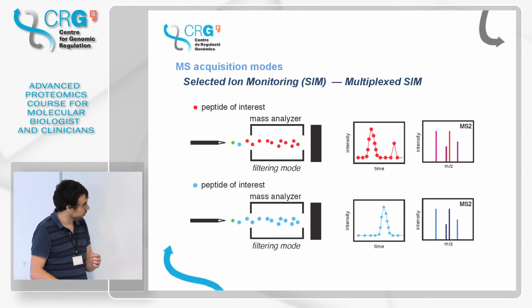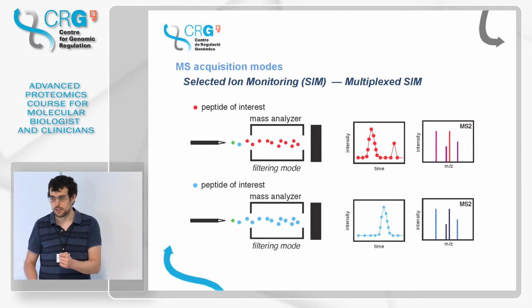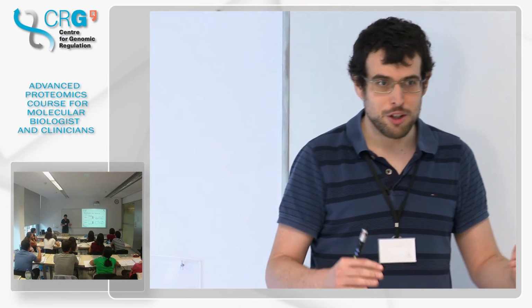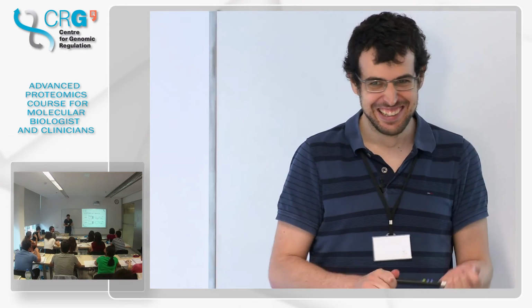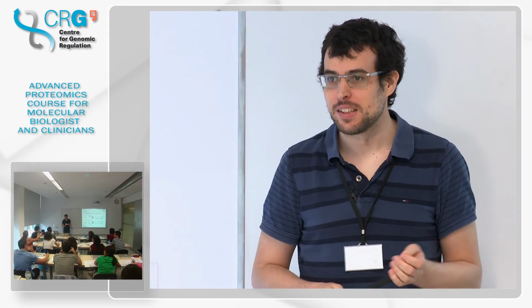I can monitor this, I can get the Ms2, and in the meanwhile, I can also do another peptide and get its Ms2. So, questions, because from here on it gets complicated. Are these the inclusion lists? No, no, it's another thing, totally another thing.